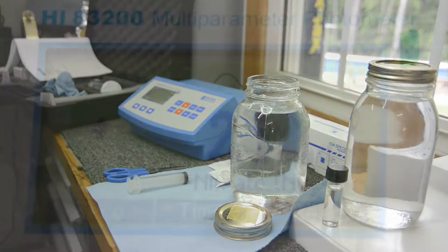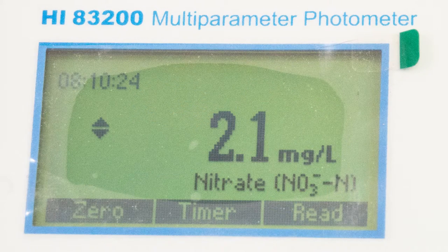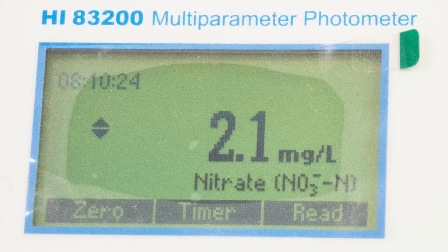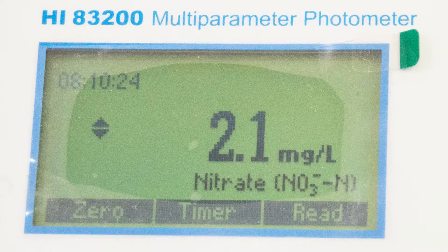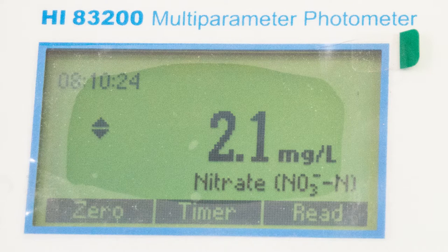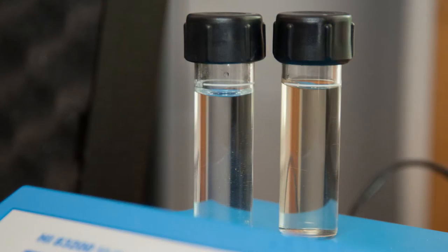We'll hit our timer again, and we ended up with 2.1 milligrams per liter, which is pretty good. We started out at 0.5, we ended up at 2.1, so we had an increase of 1.6 milligrams per liter, or 1.6 parts per million of nitrate. You can see in the 'after' sample, it turned the water yellow.